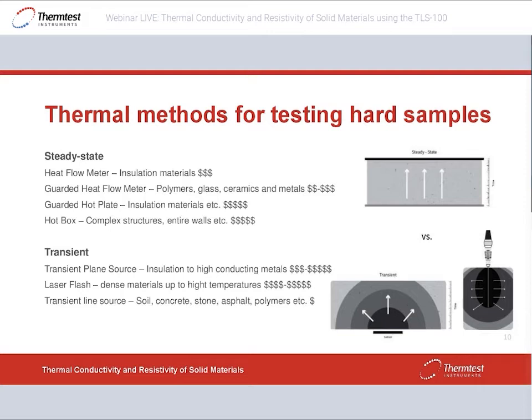Those machines are excellent, of course, and the standard of thermoconductivity testing. But transient methods have very nice applications because they are flexible and fast machines. You have the transient plane source, which is a very versatile instrument, doing everything from insulation to conducting metals. But it's expensive and it is not very portable at all.